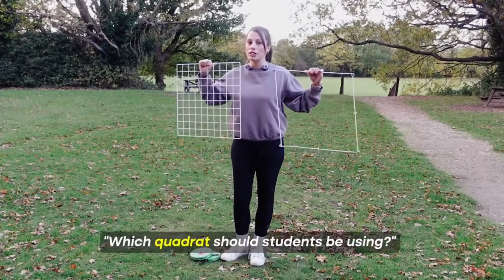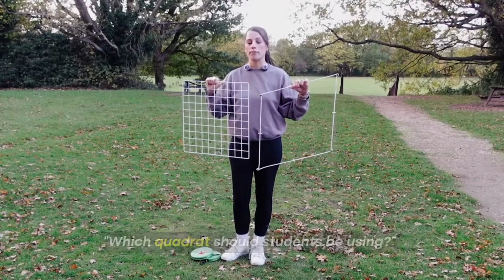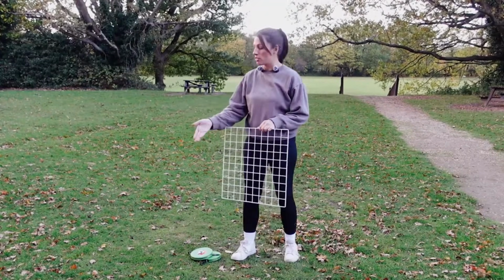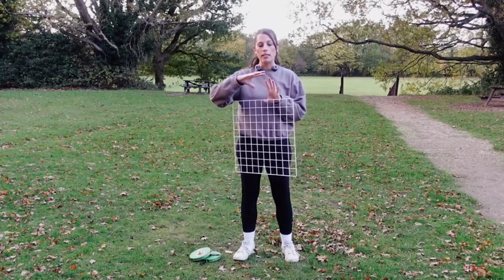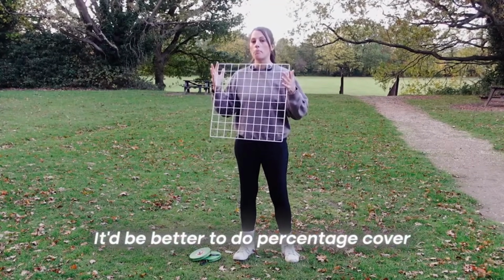So which quadrat should students be using? Well, it completely depends on what they're going to be measuring. If they're going to be recording the abundance of a plant species where there is far too many to count accurately, so for example, the grass. I'm not going to be able to count every single grass plant in this field accurately. Or if it was moss where you can't completely tell where one plant starts and the next ends, then it'd be better to do percentage cover.